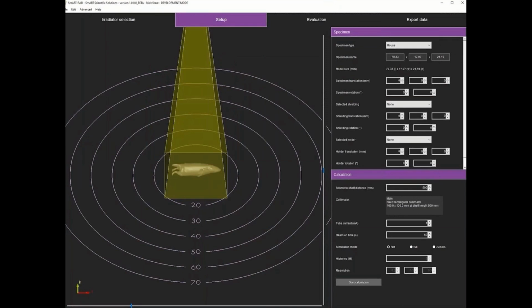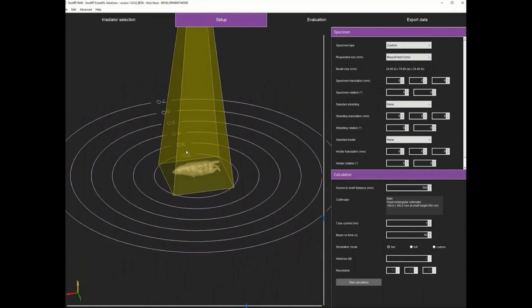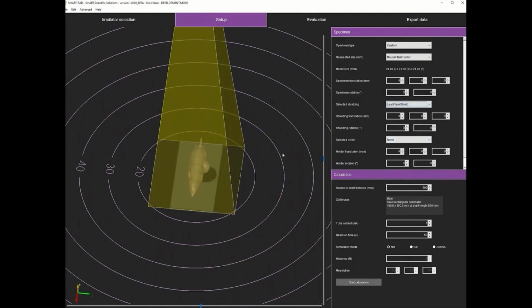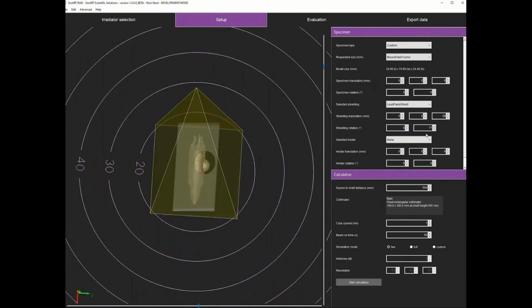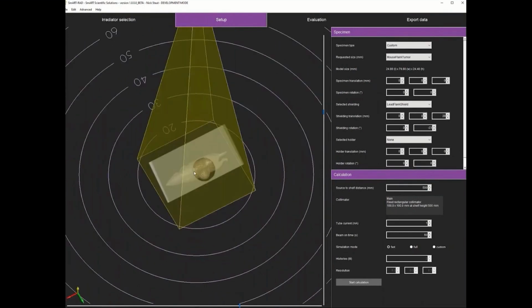So for the next setup, we show a custom geometry, which we created earlier. I did increase the size of the tumor so it's visible here. And we also pick a shielding. Here the shield is a very large circular cutout. And just for demonstration purposes, we also incline the shield a bit to show that you can pretty much make very strange shapes if you would like.